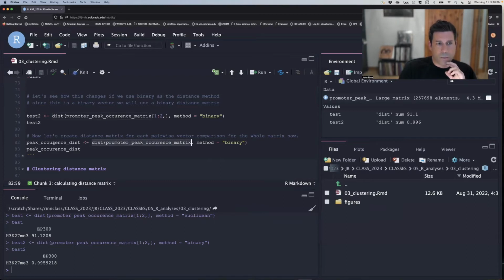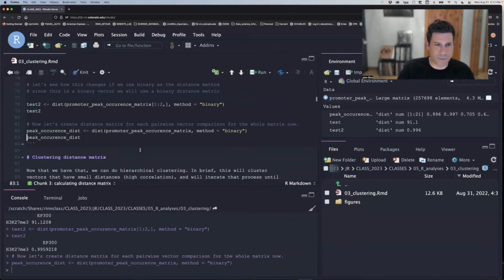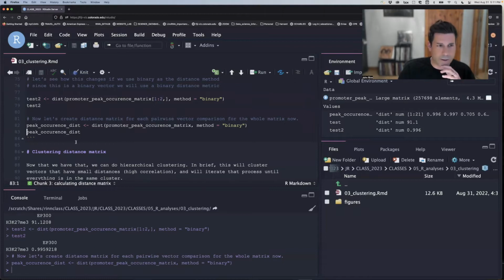And so now what we're going to do is just make a smaller data frame of values of the correlations between all pairwise across my 7 proteins. Okay, so let's do that. So now we're going to do this across all 7. And so we're going to see this matrix get bigger. Okay, sorry, smaller, because we're just measuring the correlation values instead of the entire values of the data set.